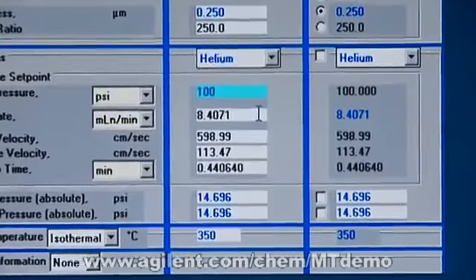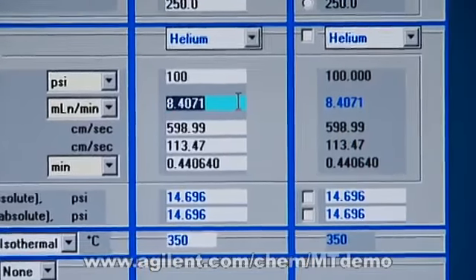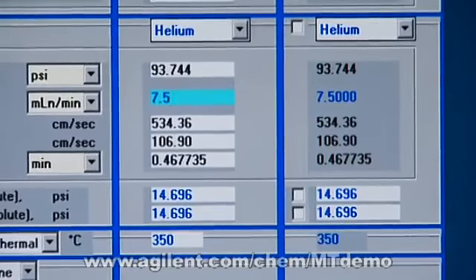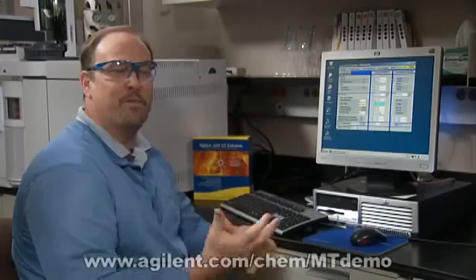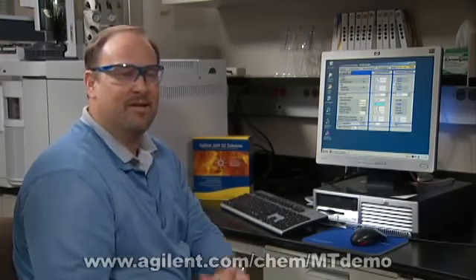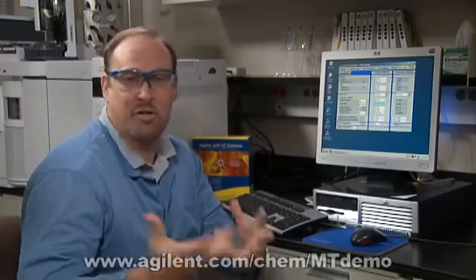And that'll be the maximum. So let's put in something a little bit lower than that, 7.5 mils per minute. And now we can see that it takes about 93 psi. And that's one of the beautiful ways that Method Translator can really help you figure out the feasibility for pressure programming, flow programming, whether or not you're going to have enough pressure to do those kinds of things.